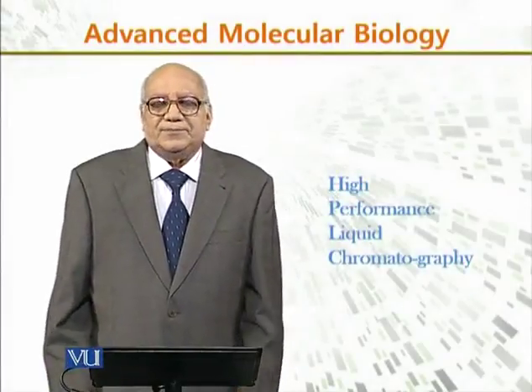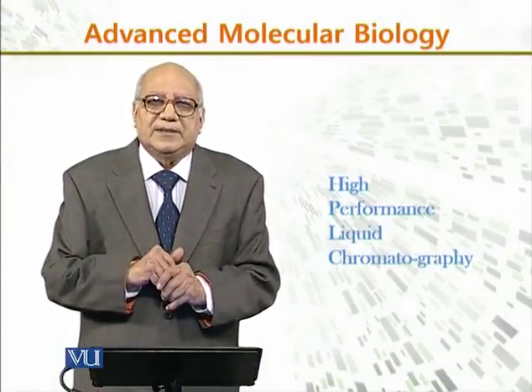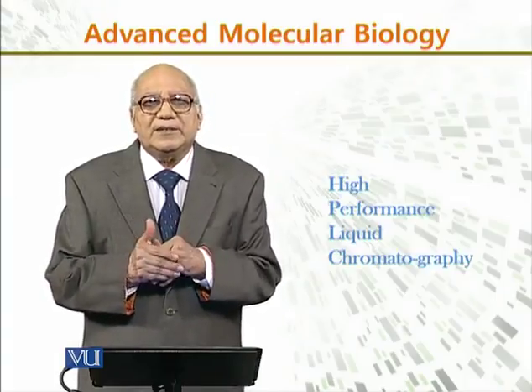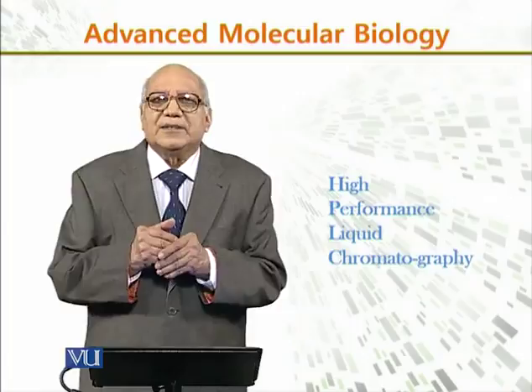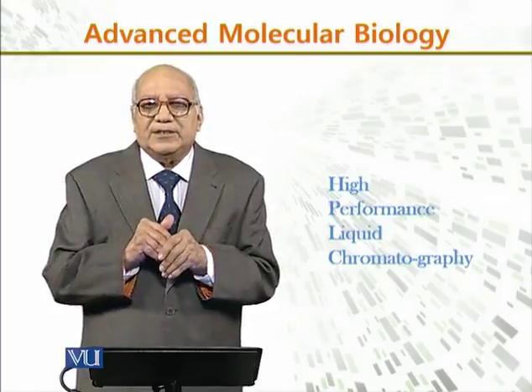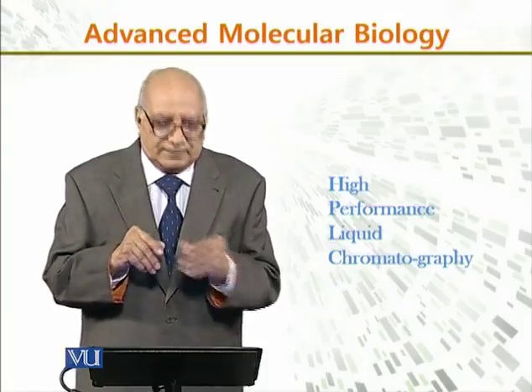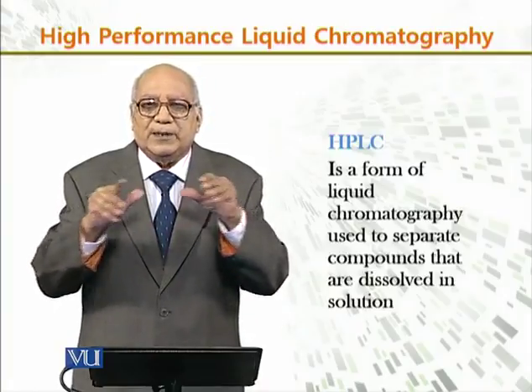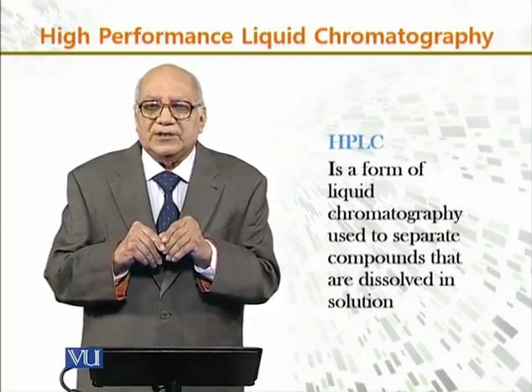Now we will discuss in this module a very high-tech analytical technique which is equally used by chemists, by molecular biologists, by analysts and physical chemists, you name it. That technique is called HPLC, which stands for High Performance Liquid Chromatography. Now, this is a form of liquid chromatography which is used to separate the compounds that are dissolved in solution.